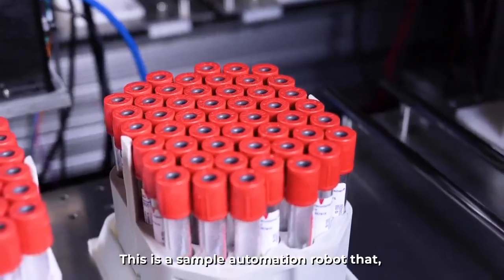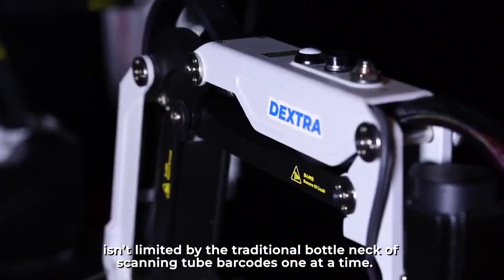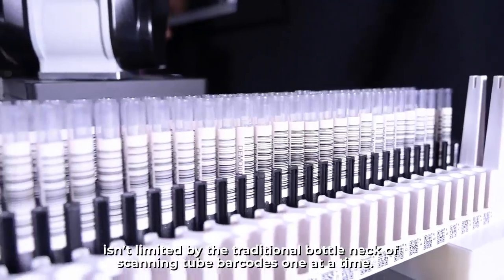This is a sample automation robot that, when combined with Eidetic scanning technology, isn't limited by the traditional bottleneck of scanning tube barcodes one at a time.